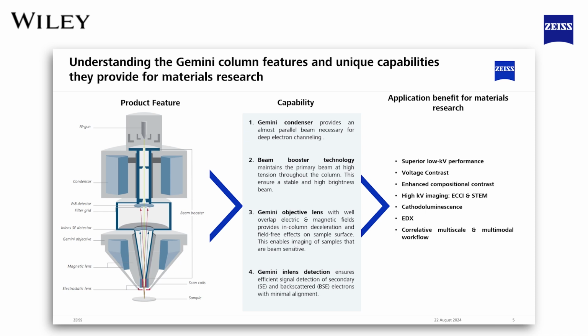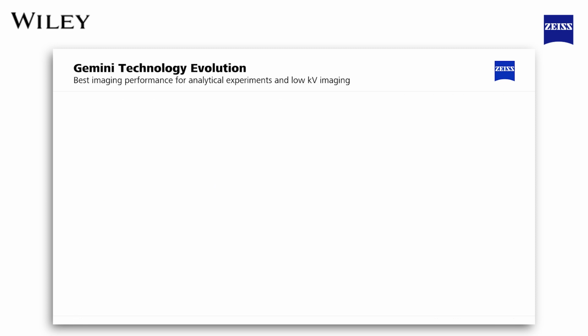The end result is you get superior low kV performance, you can get high voltage contrast, you can get enhanced compositional contrast, and other modes like ECCI, which we shall look into.